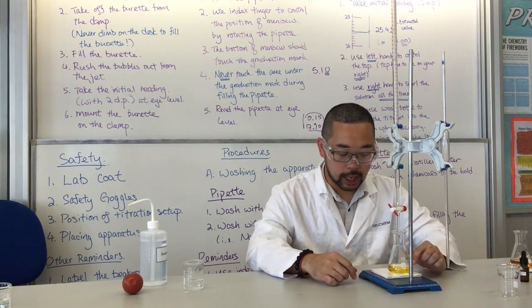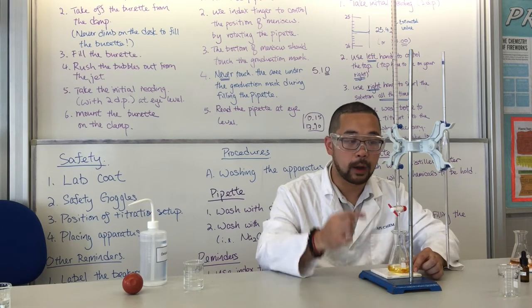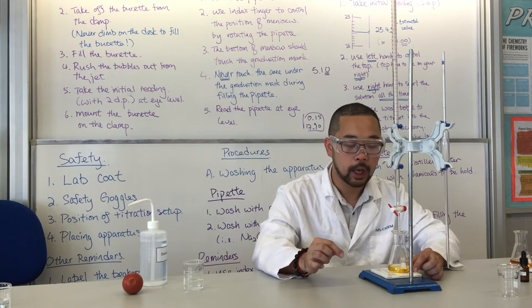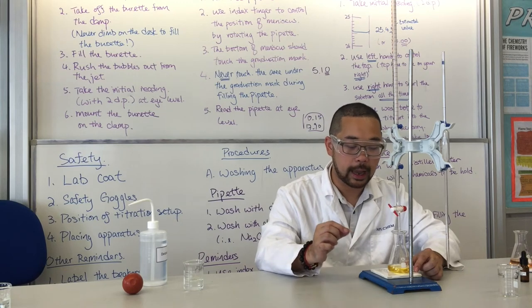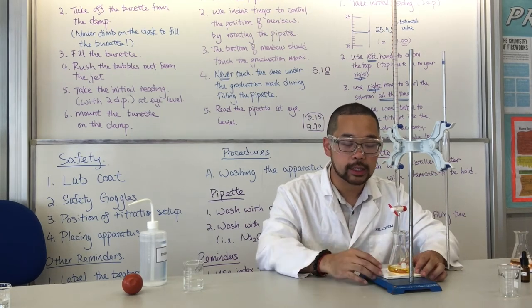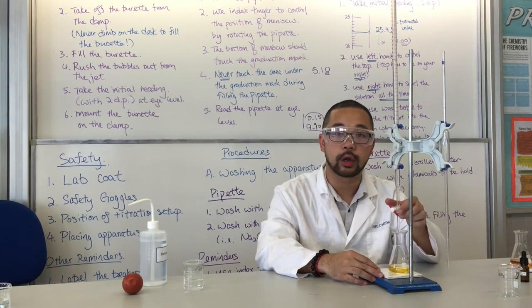When you add the titrant into the solution, you'll find that the color will change. Right now, the color is yellow, but when the acid runs into it, it slightly changes into pink. But the pink color will very quickly change back to yellow. The time for changing back to yellow is very short at the beginning. But at the later part, when the end point is approaching, you'll find that the color takes a longer time to change back to yellow. At that time, we'll know that the end point is approaching. What you need to do then is add the solution slower, drop by drop, by controlling the tap.